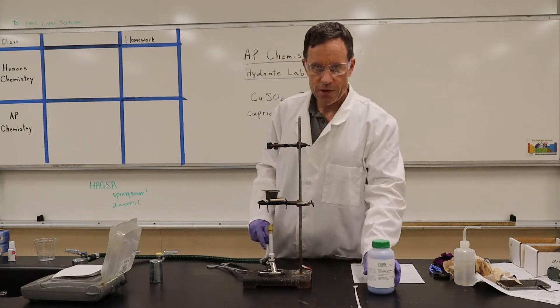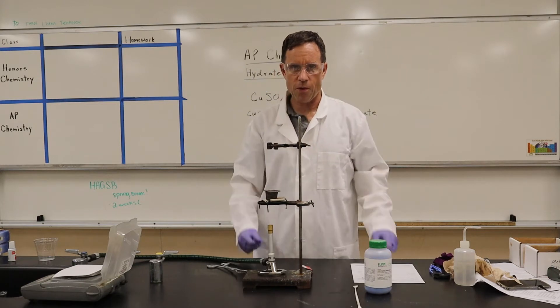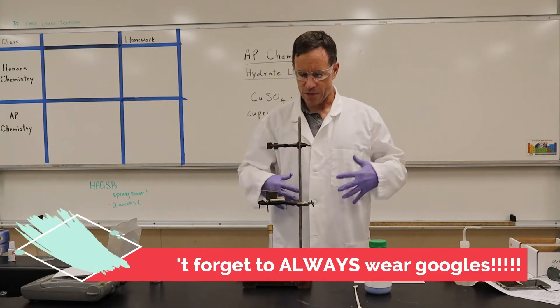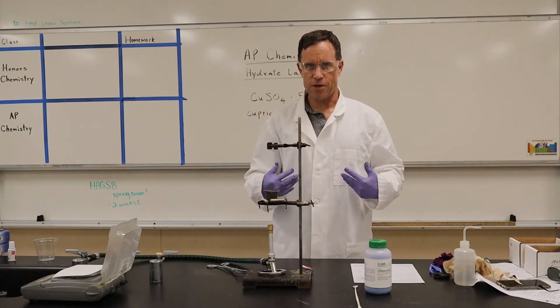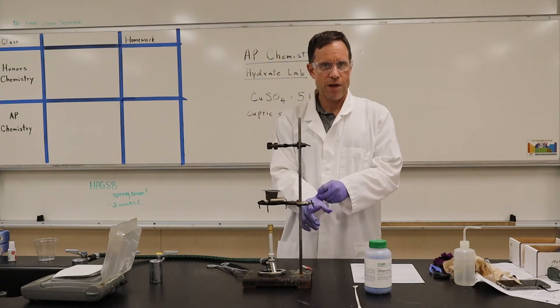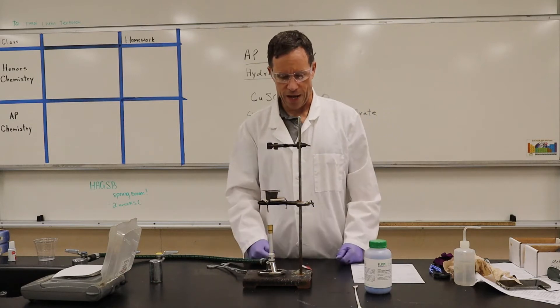We're going to be using a few different instruments. First of all, make sure that you're wearing your goggles — that's really important. And if you have a lab coat or something like that, that's also really good because it prevents things from splattering on your clothes. I'm wearing gloves also, which is helpful. You don't want to get dangerous things on your hands.